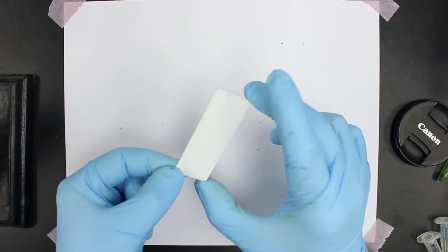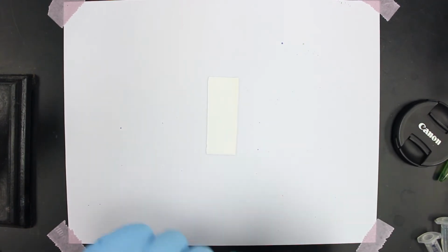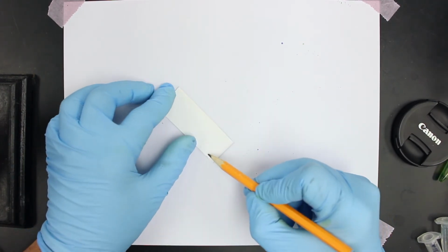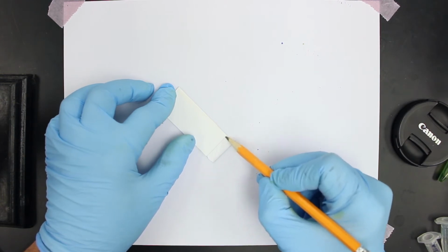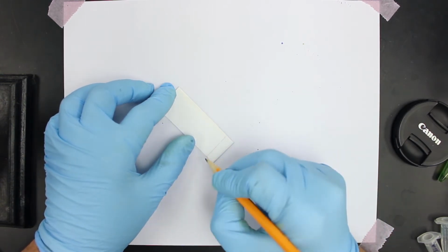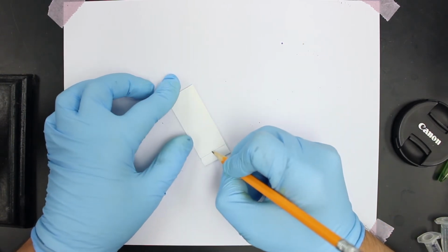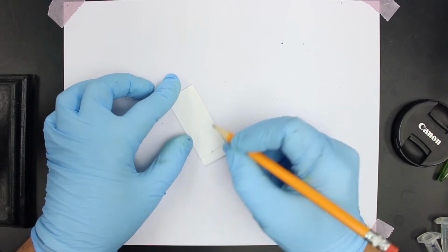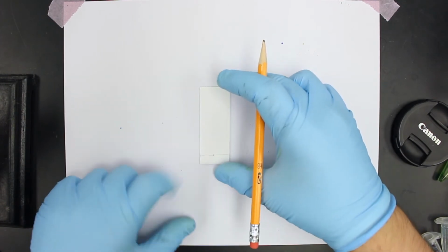So to perform a thin layer chromatography, you take your plate, and the first step is to mark the bottom of the plate about 1 centimeter from the bottom. So we're creating our origin line here. And we're also going to mark where we're going to apply our spot. So in this case, we're only going to be doing one analysis on this particular plate.